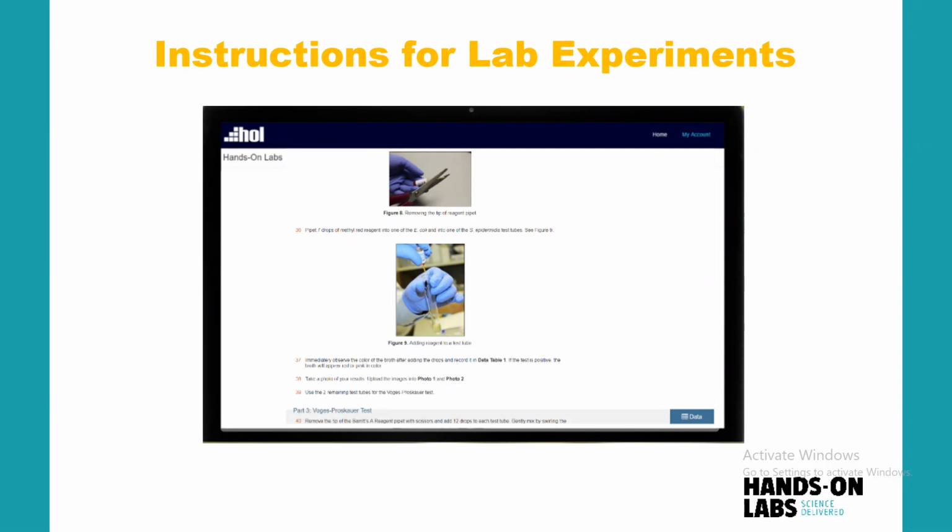Now, at the bottom of each of these procedural pages, the student will encounter a blue data tab. And the students are going to use these blue data tabs to record their observations or measurements that they are expected to record within the step-by-step procedures.